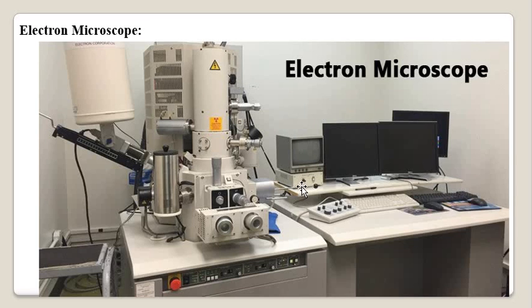Then a transformer is also there. This is said to be the transformer. The electron microscope requires a high voltage current for the electron gun and the electromagnetic coils, right? So for this, high voltage transformers are used, which can boost the voltage from 220 volts to 50 to 100 kilovolts. So transformers are used for directing more electric current to the electron microscope.